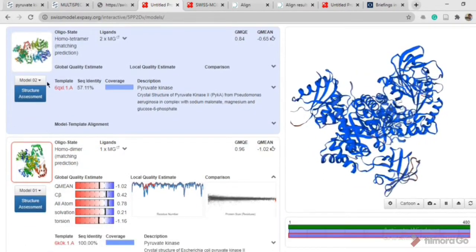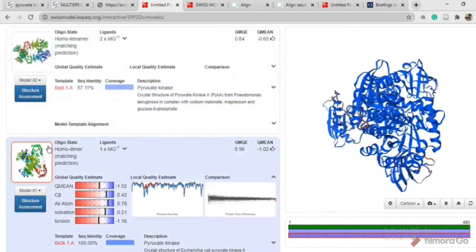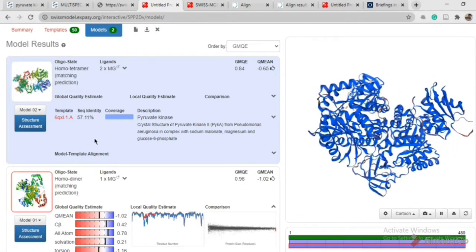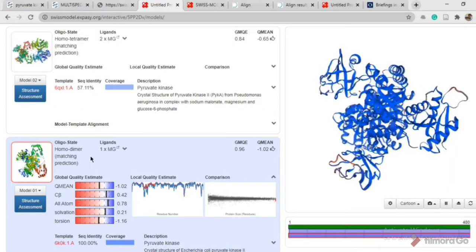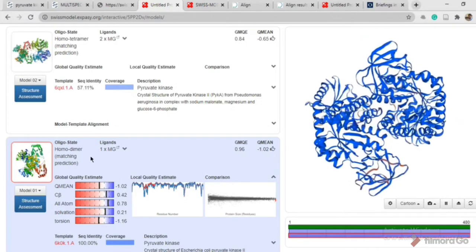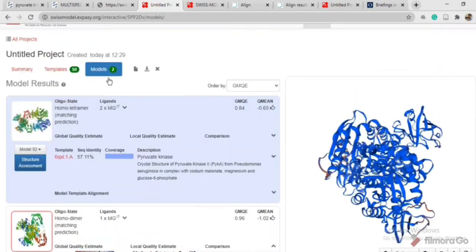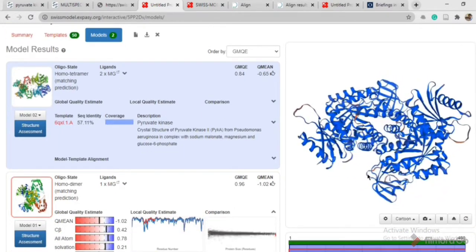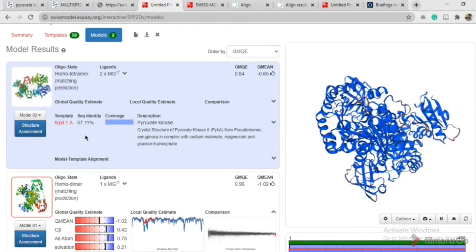Here you can see there are two types of models: model number one and model number two. The difference is that one structure is a homo-tetramer and the other is a homo-dimer. One magnesium ion is necessary for its functioning. Here you can see one model has one magnesium ion and the other has two magnesium ions — this is your pyruvate kinase protein.